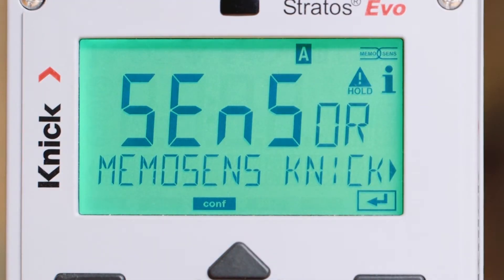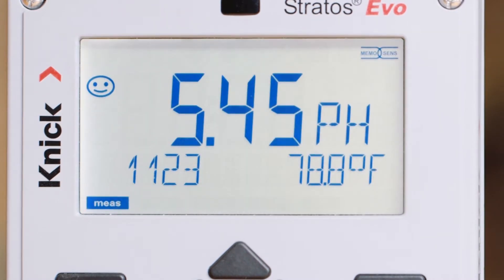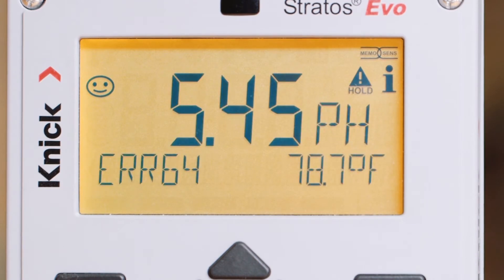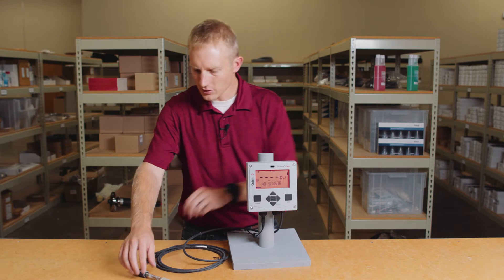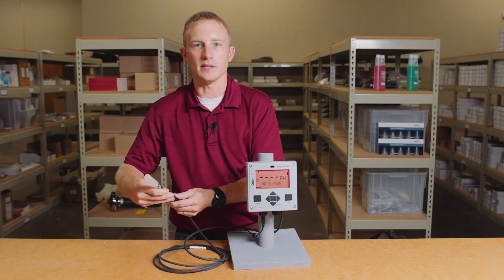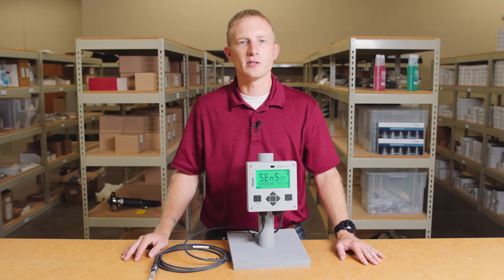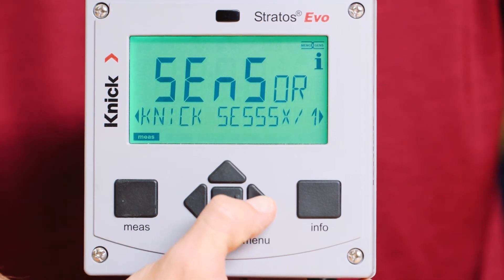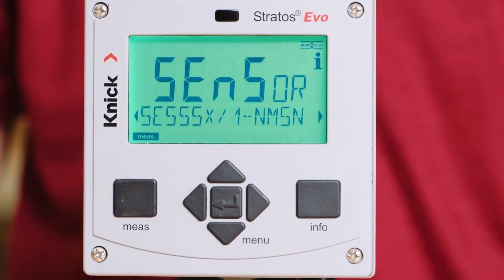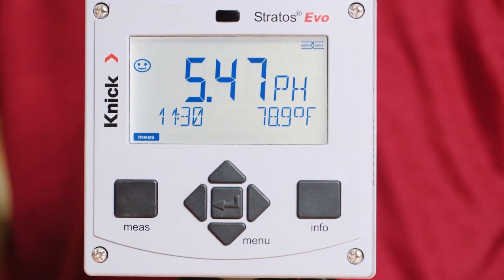The Stratus Evo has a bright, backlit, multicolored display. The screen will change color for quick indication of a change in the sensor status or if you open new parameters within the transmitter. The screen is now red because it cannot find a connection to the sensor. When a MemoSense sensor is first connected, the screen will turn green and the transmitter will indicate the model and serial number of the sensor that's connected. The transmitter will then change to a white screen, indicating that the loop is now in measuring mode.